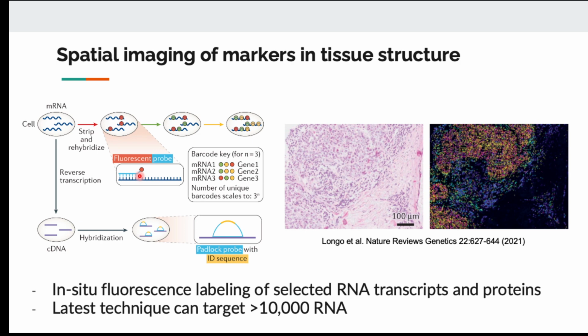So people thought, why don't we create a combination of fluorescence but across multiple probes? So the first step is we have a gene. A gene is really quite long. In nanostring, you are targeting that gene with only one probe. But who's to prevent you from designing multiple probes per gene, like microarray?